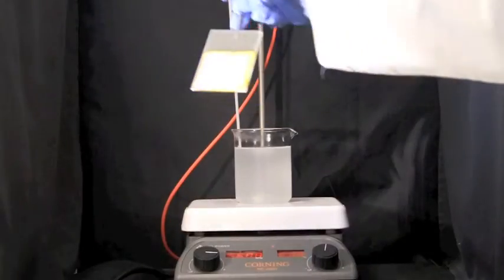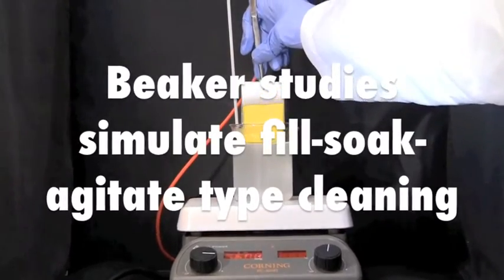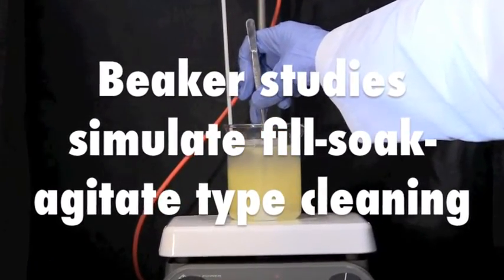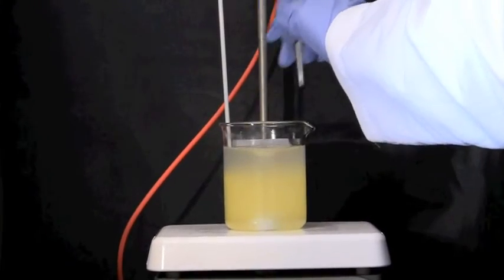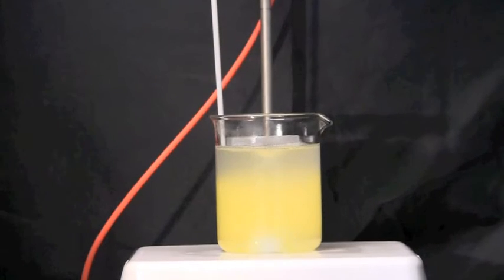The ACM study gains momentum with the first beaker studies. In these studies, which simulate fill, soak, agitate type cleaning, only mild agitation is provided in order to best study the soil detergent behavior.